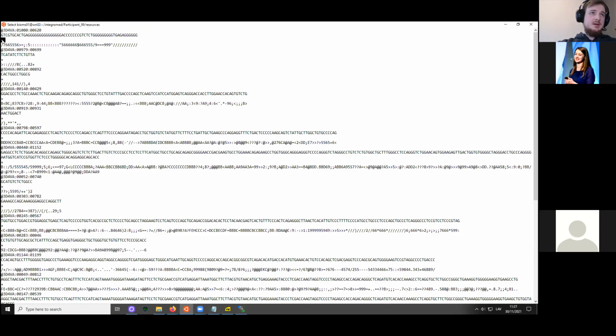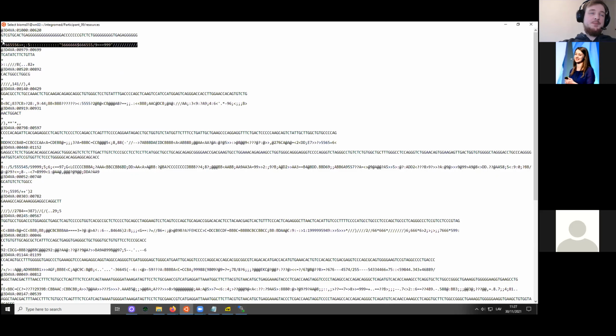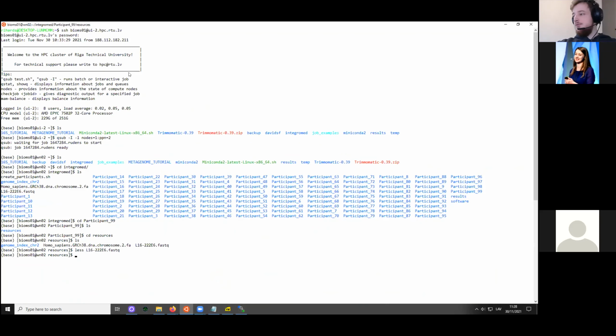In this case, we have a plus sign, which is a sort of interesting artifact from when this file format was created. And in the last line for this first read, we have the quality information coded in ASCII. So basically, these symbols have to be translated into actual numbers. But this is the more efficient way to store the qualities. That's about it for the Fastq file.